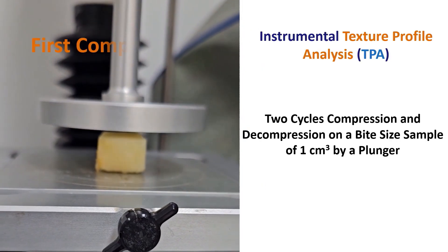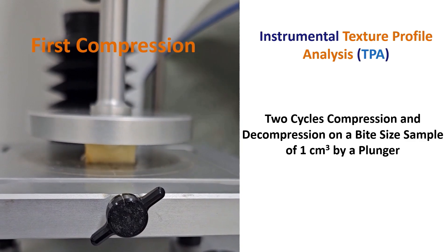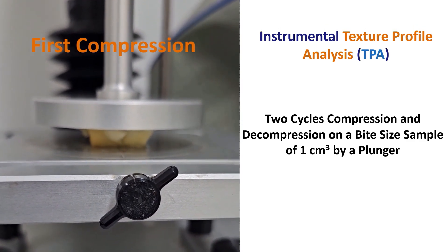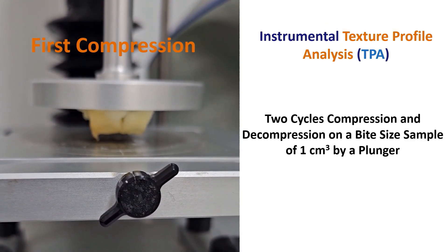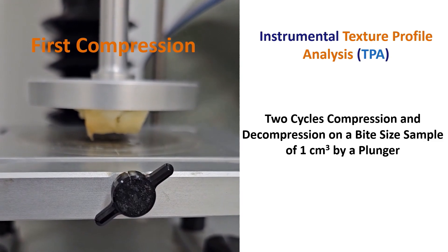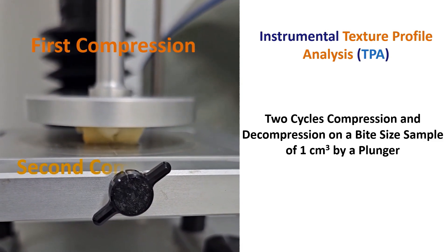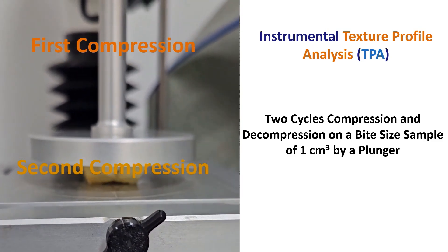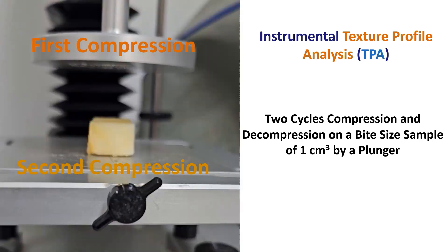Instrumental texture profile analysis, or TPA, is a two-cycle compression and decompression on a bite-sized sample of one centimeter cube by a plunger. I have a date fruit, I remove the pit, and I'm going to eat.